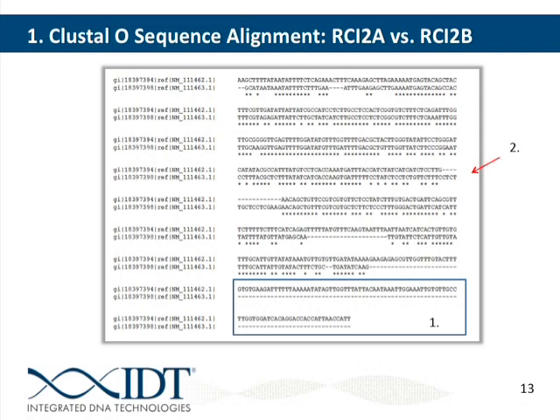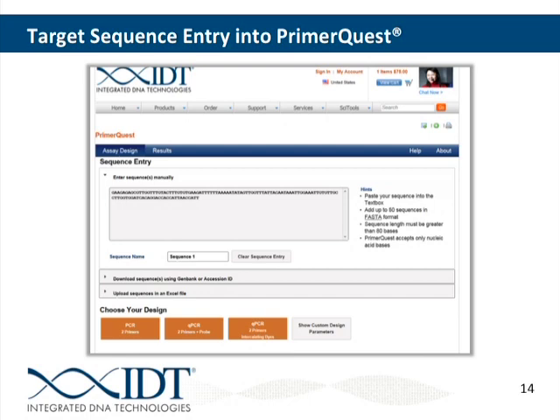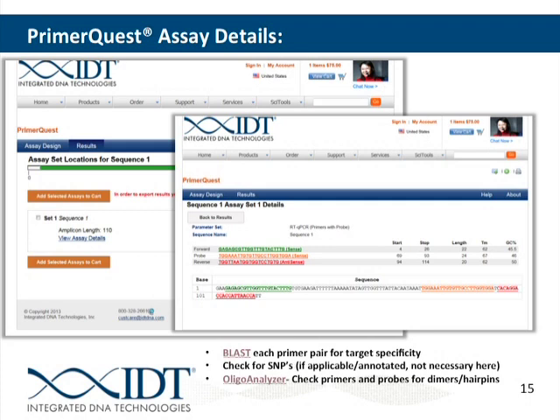All right, so we've got our Clustal Omega program open. Switch this to DNA. Copy and paste that second sequence in. And then submit. And it only takes a few seconds before it aligns your sequences. Of course, if you put in more sequences, it takes a little bit longer, but it's still very quick.